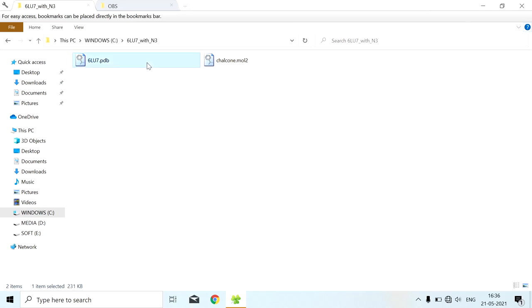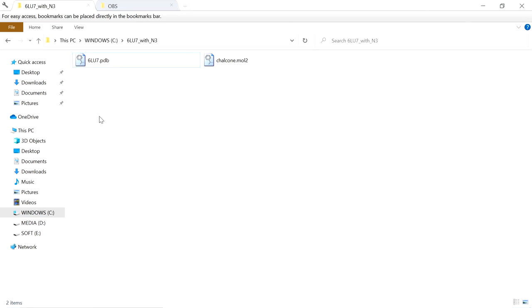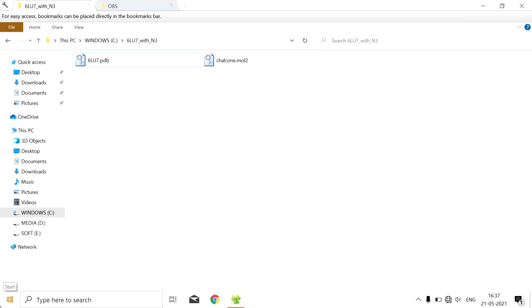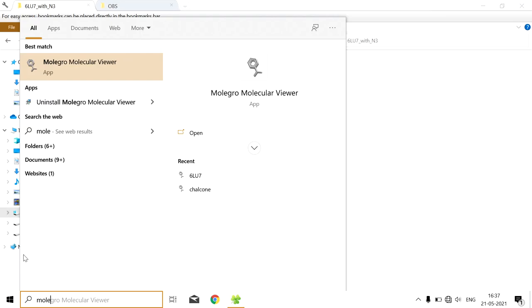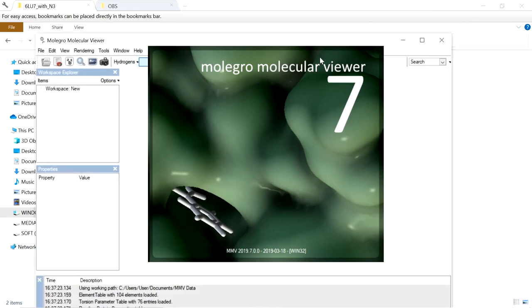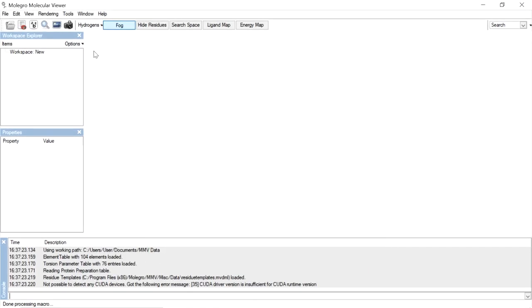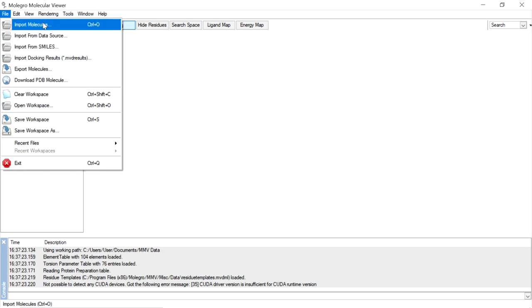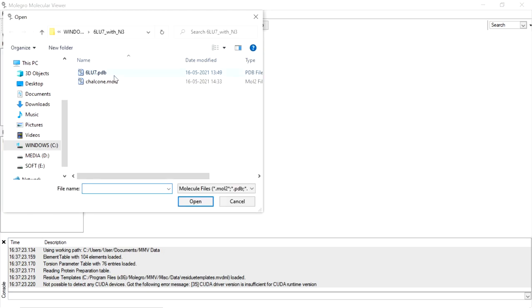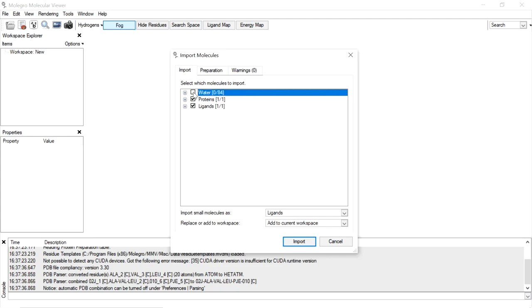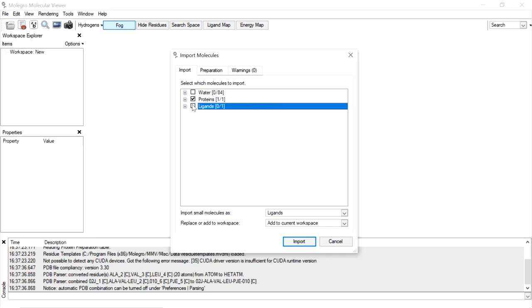The first step is protein preparation. We are going to use the Molygro Molecular Viewer. Open this tool and import the protein file. Go to File, Import Molecules, and import the protein file. While importing, uncheck waters and ligands — we don't need them.